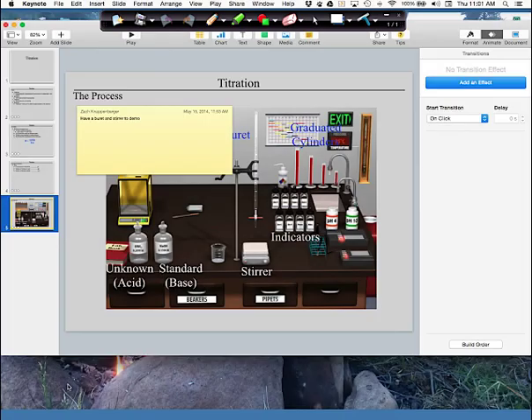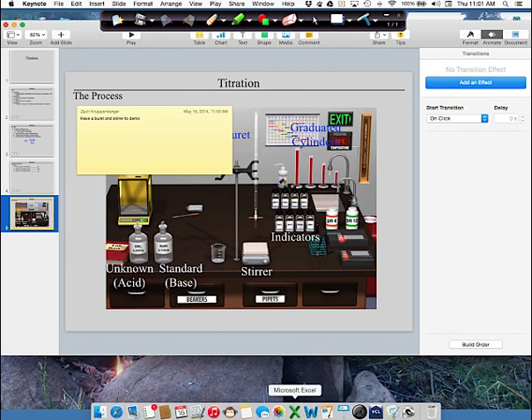Then, guys, step 1 is launch Virtual Chem Lab. When you get your laptop, you'll look at the bottom of the screen, and down here you will see, I don't know where it'll be on yours, but it's a purple square that says VCL. So you just click on VCL.